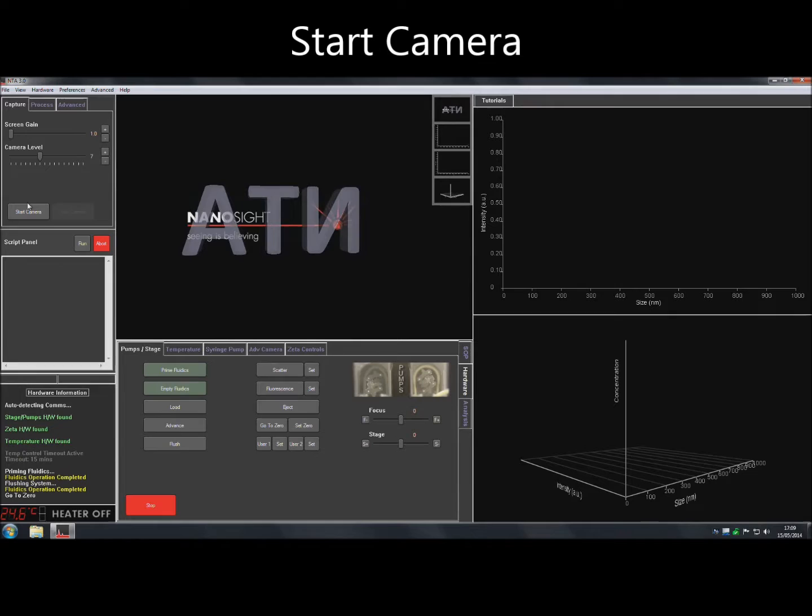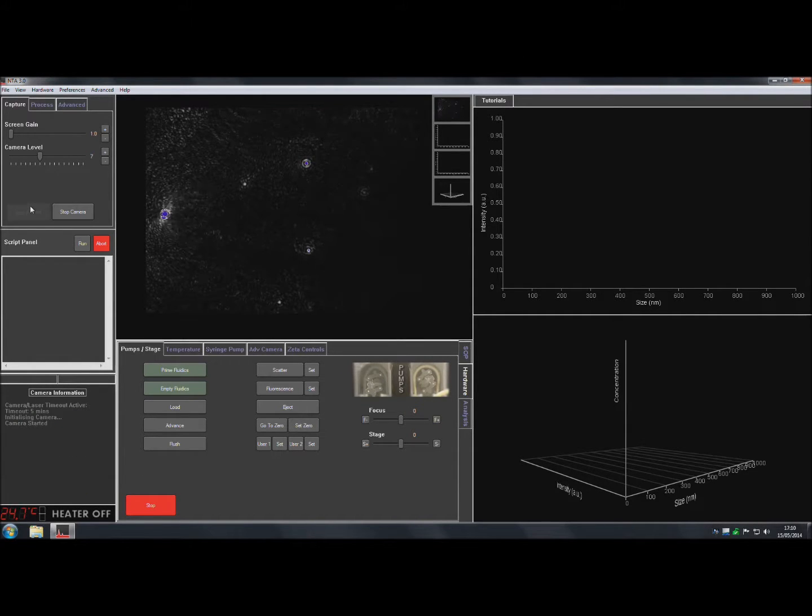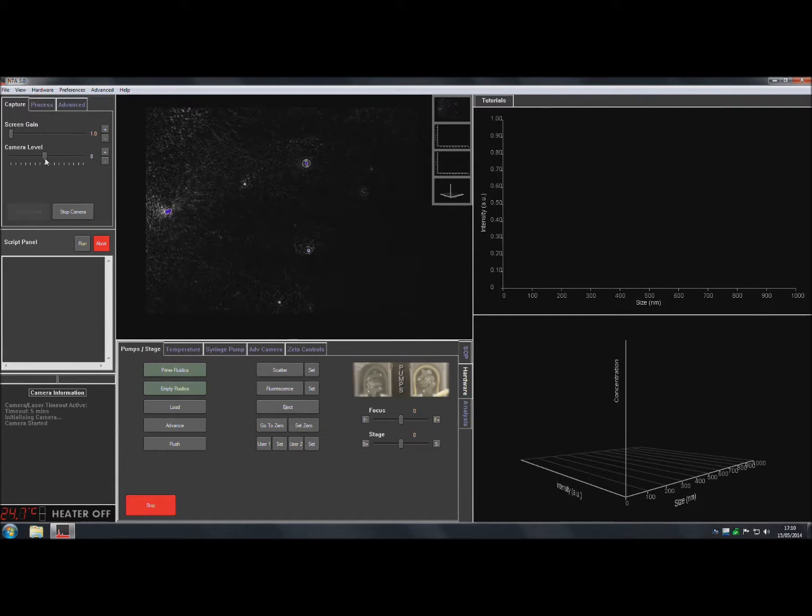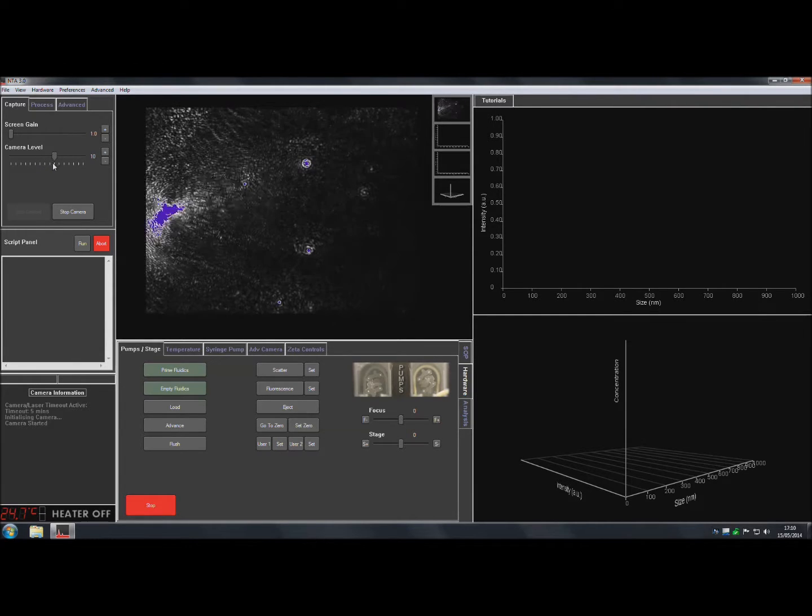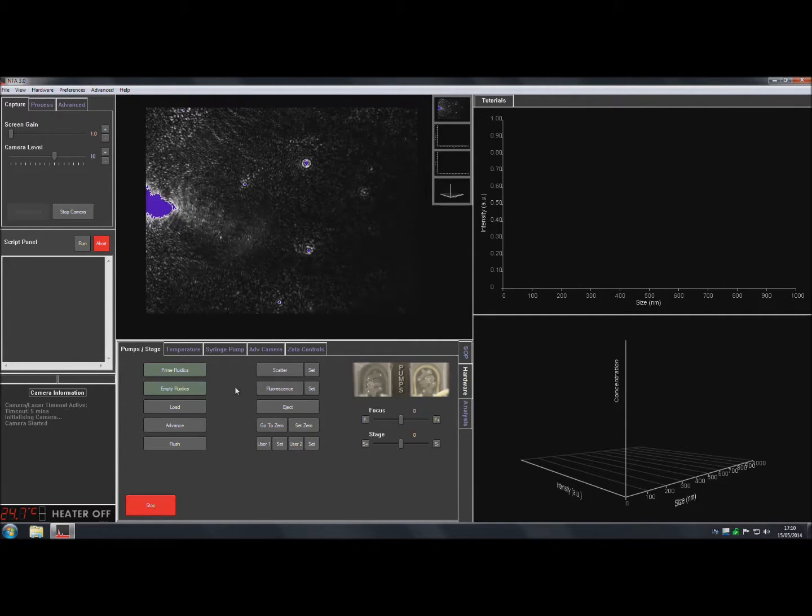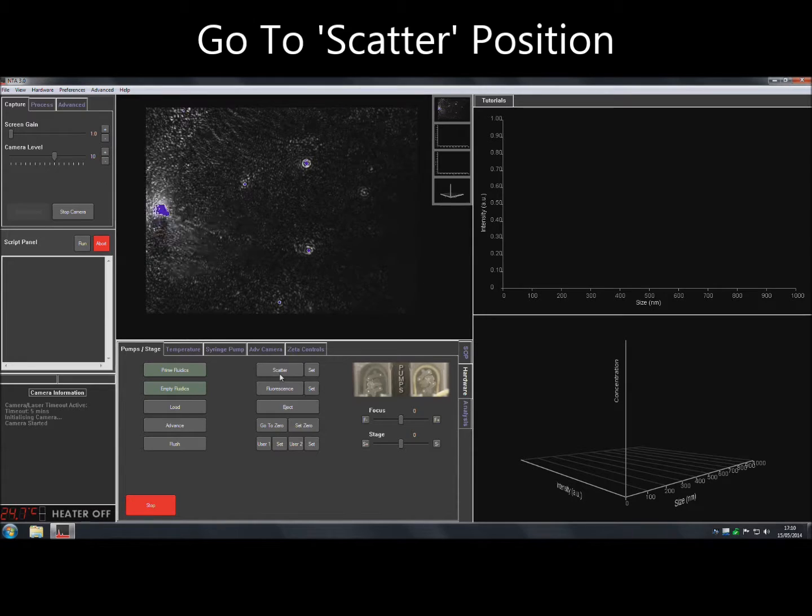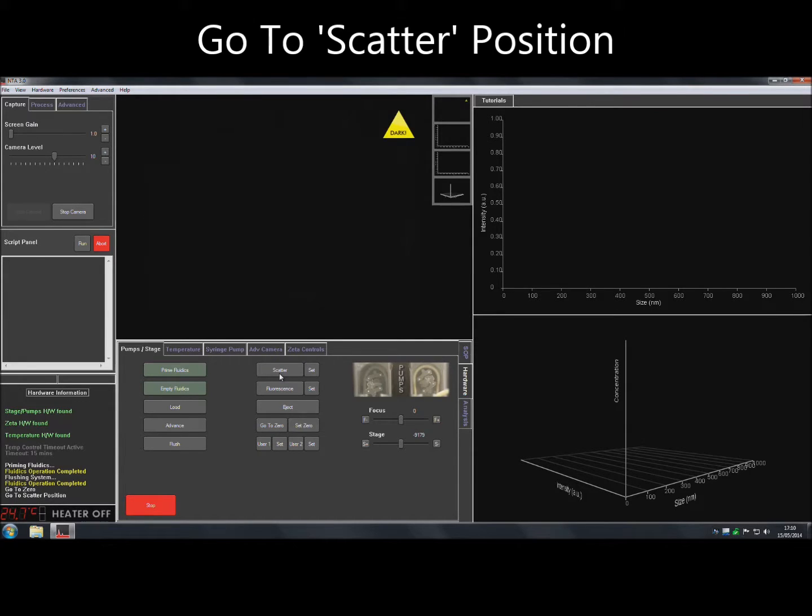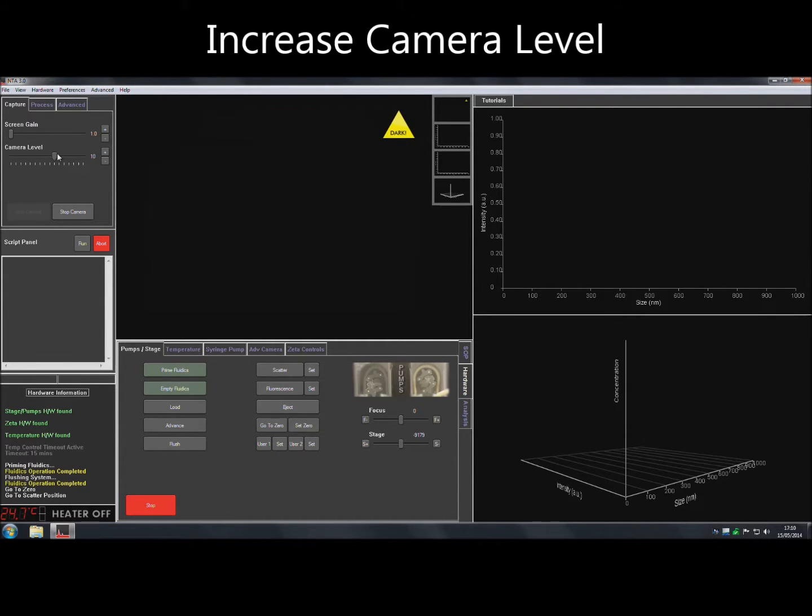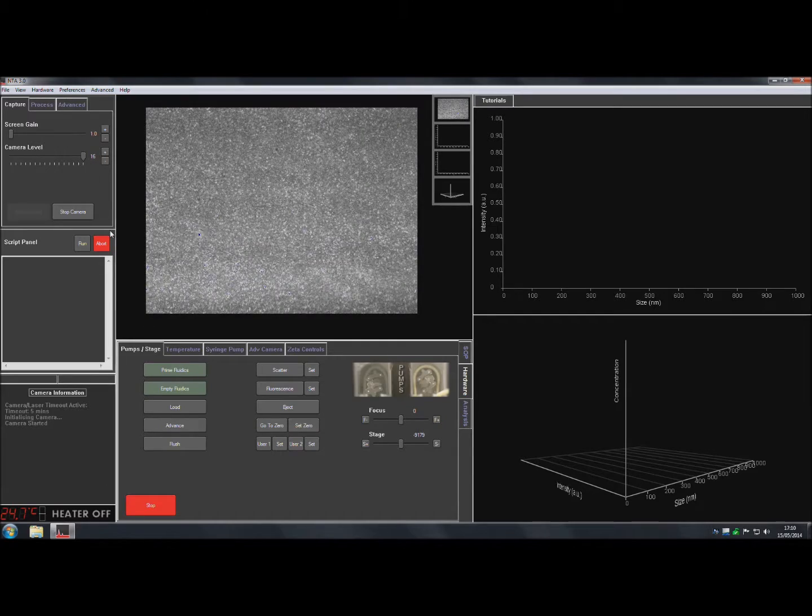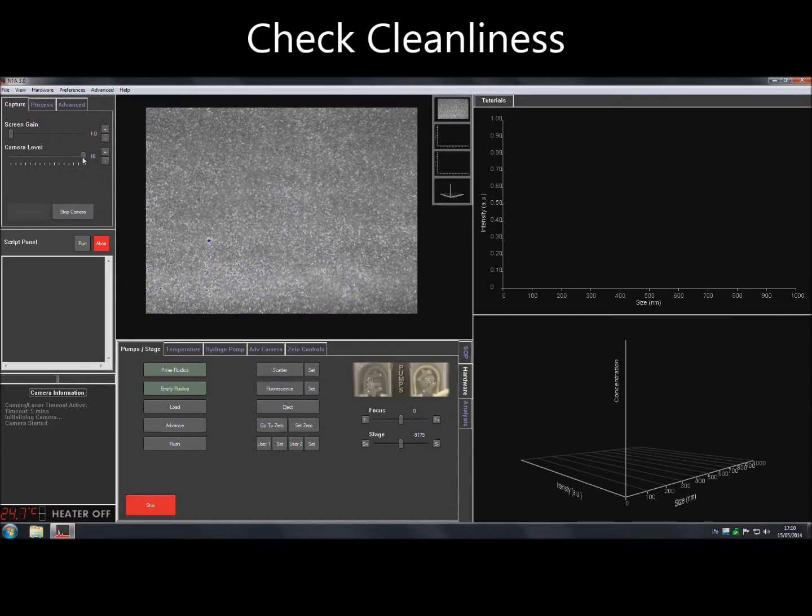Click on Start Camera to initialize the camera and set the camera level to maximum to obtain an image. Next, click on Scatter under Pumps & Stage in the Hardware tab at the bottom of the screen. This will take the stage to the optimum region for viewing particles and recording videos.